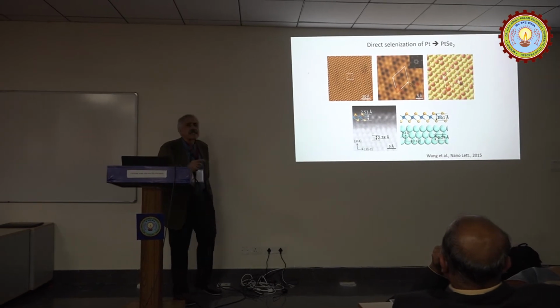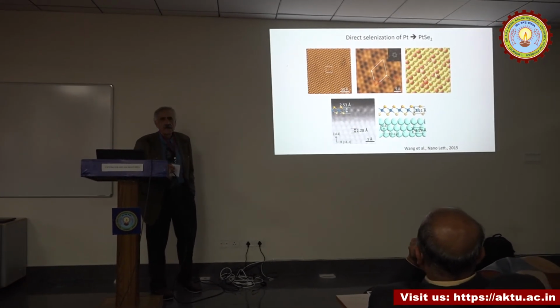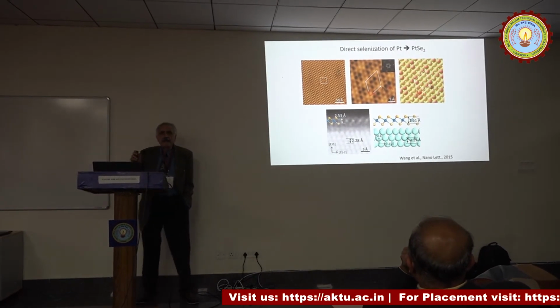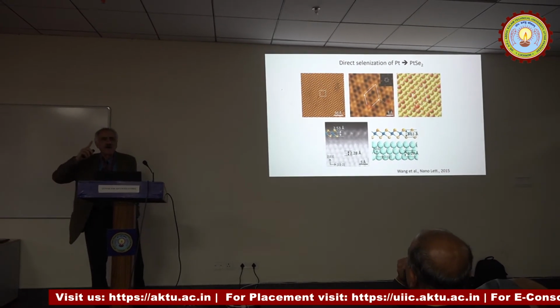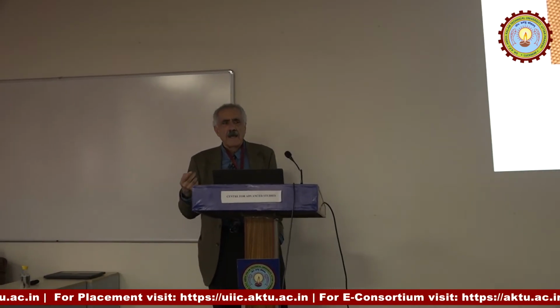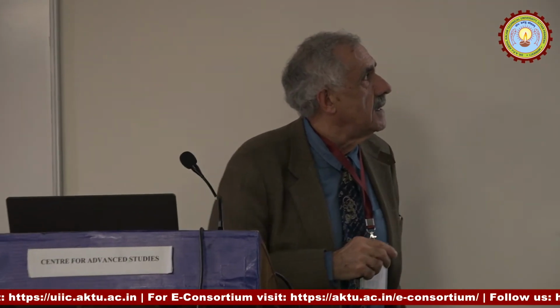And we did something simple, actually. We evaporated selenium in the vacuum chamber and cooked it a little bit, annealed it, which is the analogy of oxidation. If you have oxygen around and heat, you form an oxide. And we succeeded, in a sense, to do selenization of platinum. And we got platinum diselenide, but it took us a while to figure out what we had.